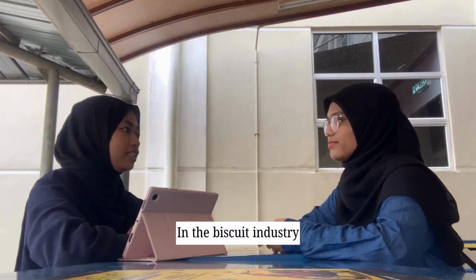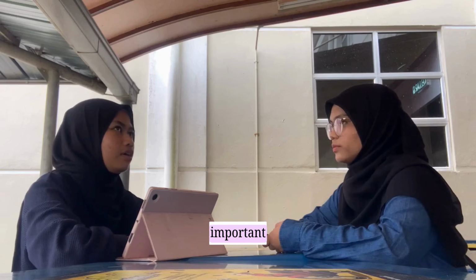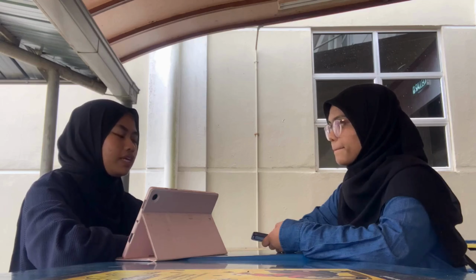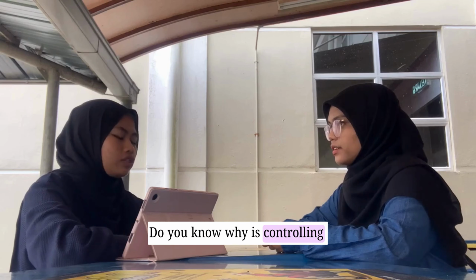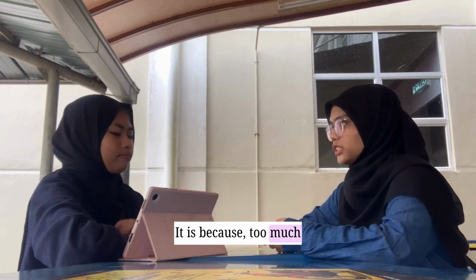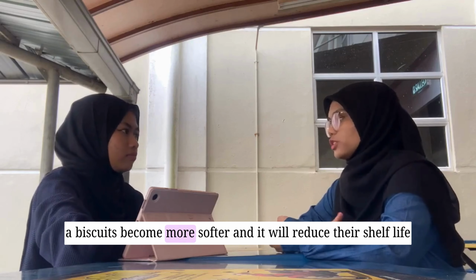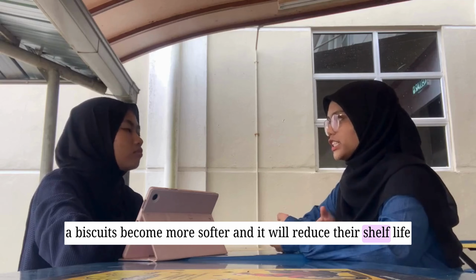So Arsha, in the biscuit industry, moisture analysis is an important quality control process. Do you know why controlling moisture is so important? It is because too much moisture can make biscuits softer and it will reduce their shelf life.